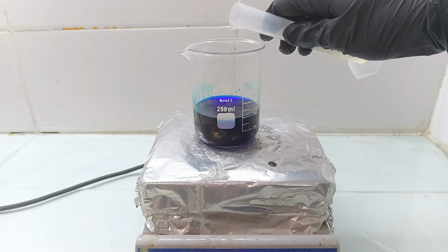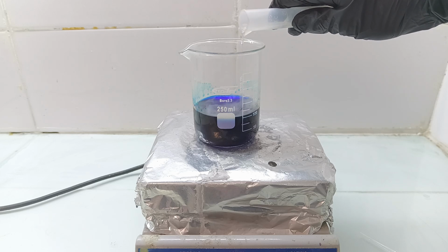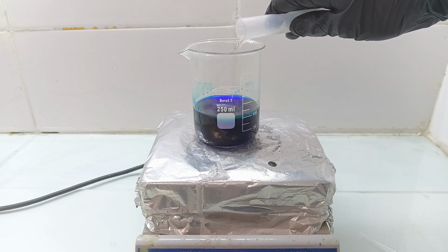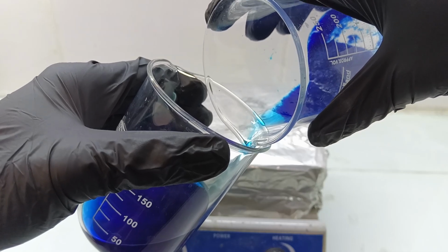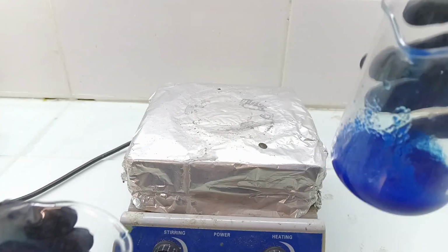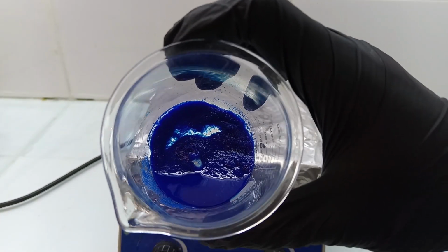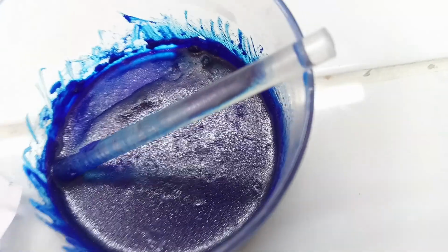Now onto the second complex. The beginning is more of the same. I added the pyridine to the solution and let it stir for a few hours. After that, the complex precipitated out as blue, needle-like shiny crystals. I decanted it and transferred it to a crystallizing dish. However, this time the complex remained blue, even after weeks of sitting in a vial.